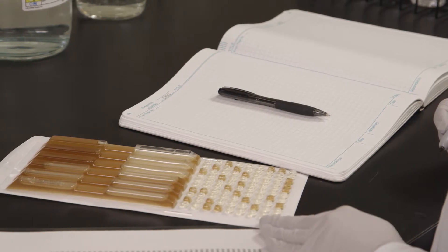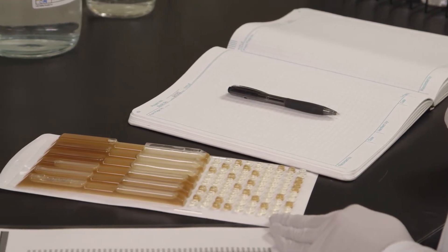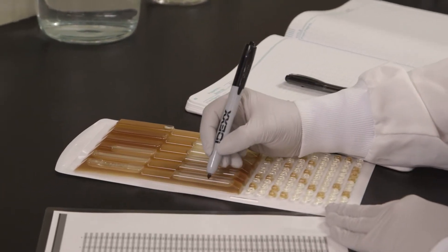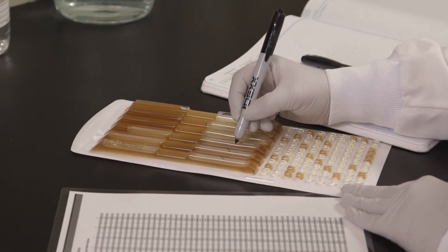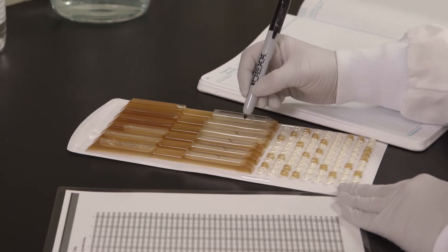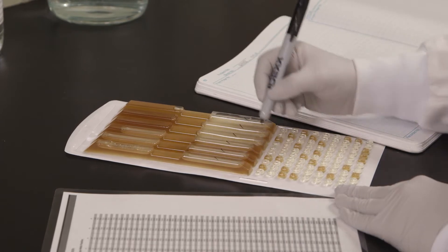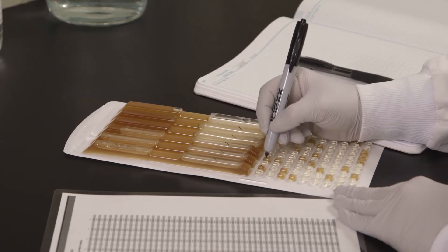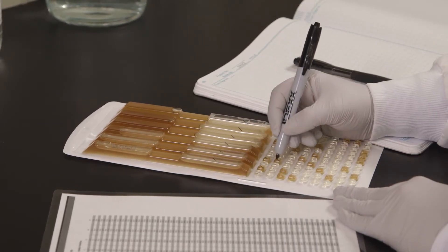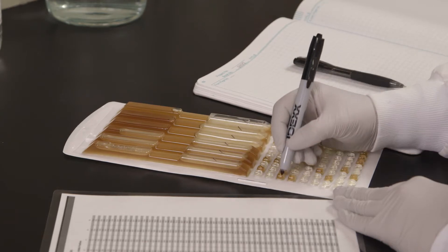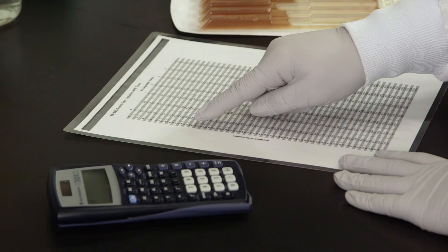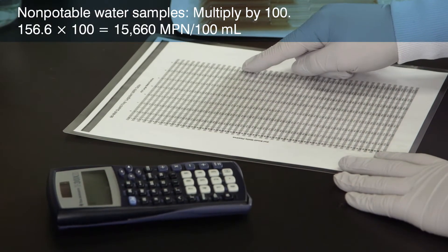After incubation, look for any indication of brown color and or turbidity greater than the negative control, which indicates a positive well. Mark each brown or turbid well, count the marked wells, and then refer to the MPN table included with the QuantiTray LEG-ALERT trays.